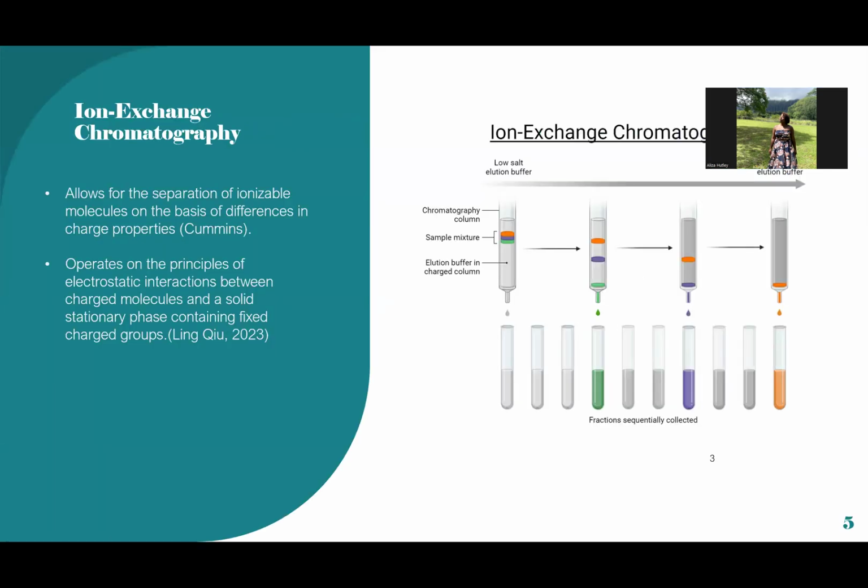So ion exchange chromatography is the focus of my presentation. I just wanted to get you familiar with chromatography in general, but now that we have an idea of what it is, let's focus on what exactly IEX is. That's the acronym for it.